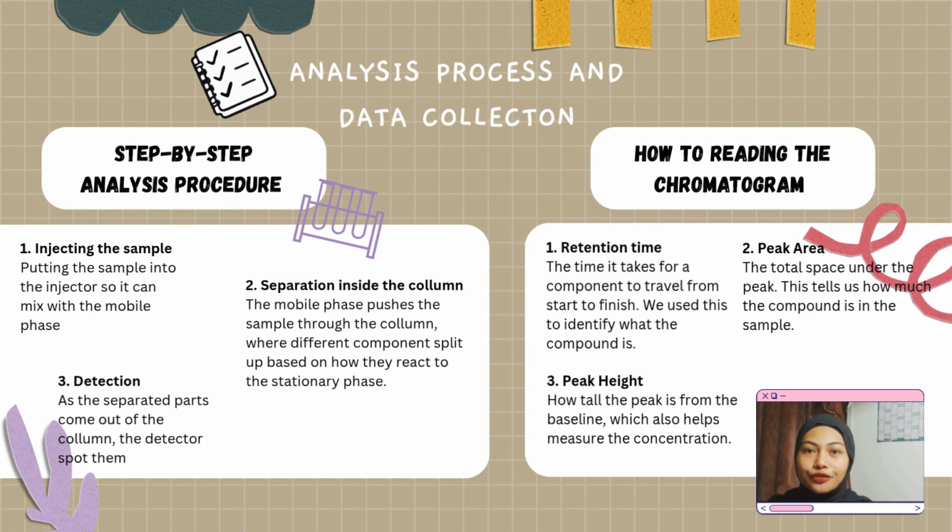Hi, my name is NURFAHIMAH and I will be talking about the analysis process and data collection. Basically, there are three main steps. First, we have sample injection. This is where we inject our sample into the system so it can join the moving mobile phase.